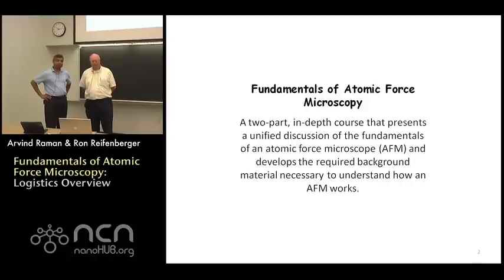So just to remind you, this is a two-part course called the Fundamentals of Atomic Force Microscopy. It will present an in-depth discussion about some of the basic principles underlying the use and practice of atomic force microscopy. Most of the material that will be covered will be developed in lecture. So even though the course material requires a broad background of information, we're going to do a lot of the heavy lifting and provide you with the background material that's required for you to understand some of these fundamental principles.